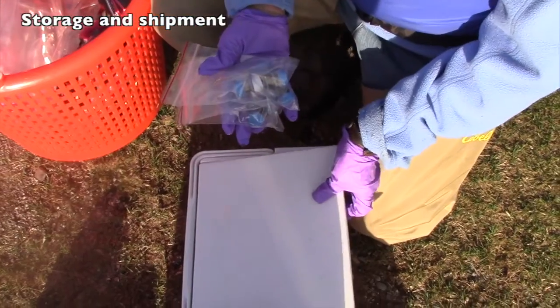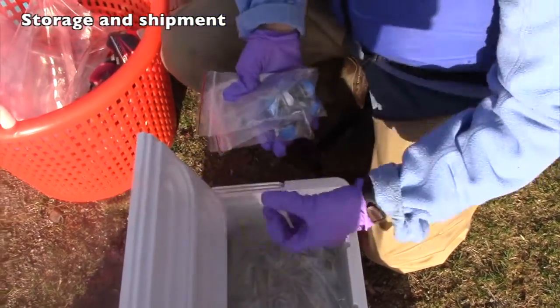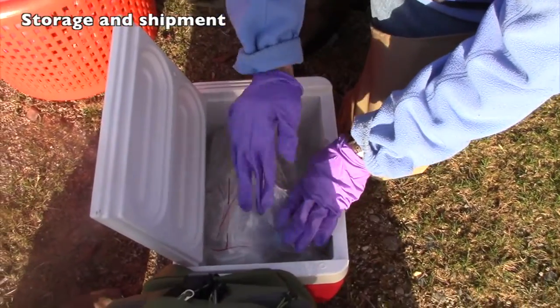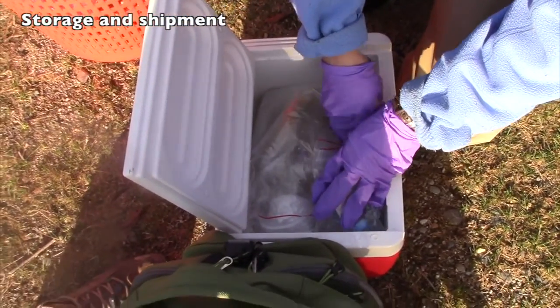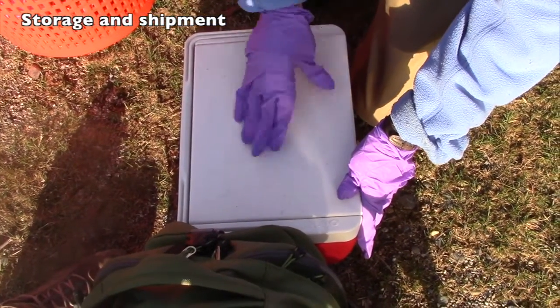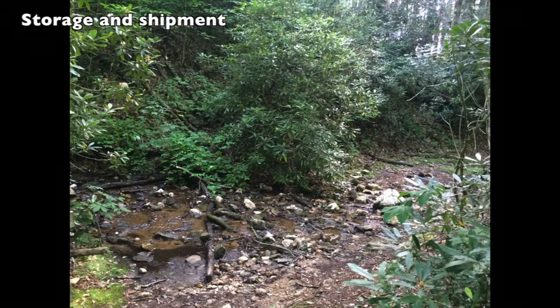Put the sediment samples on ice until you return to the office, lab, or field station, wherever there is a freezer. Sediment samples are frozen like the dragonfly samples and shipped on dry ice. They can be kept in the freezer until all your sites are done. Leave no trace — be sure to collect all of your field gear and remove trash from the sample site before departing.